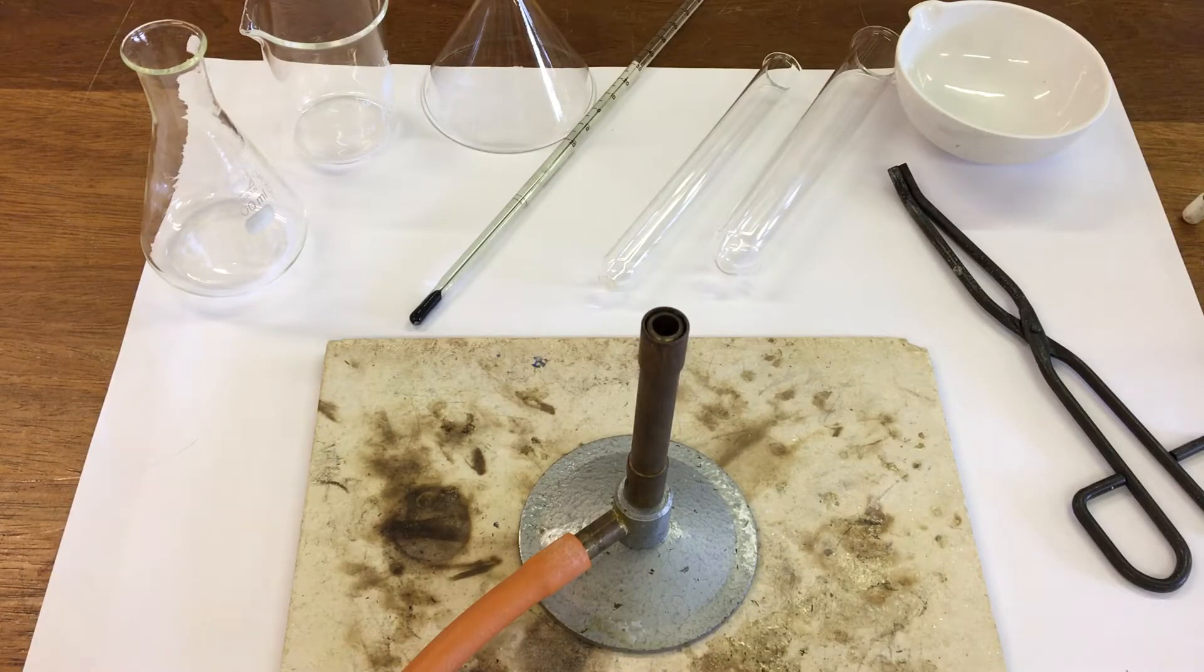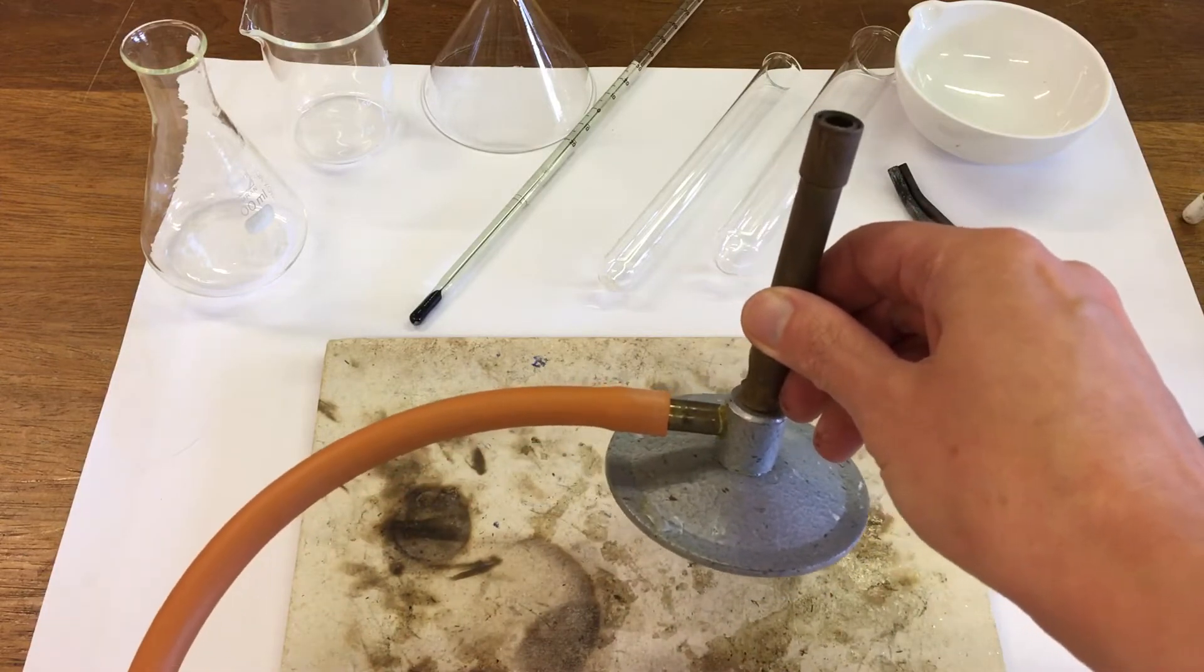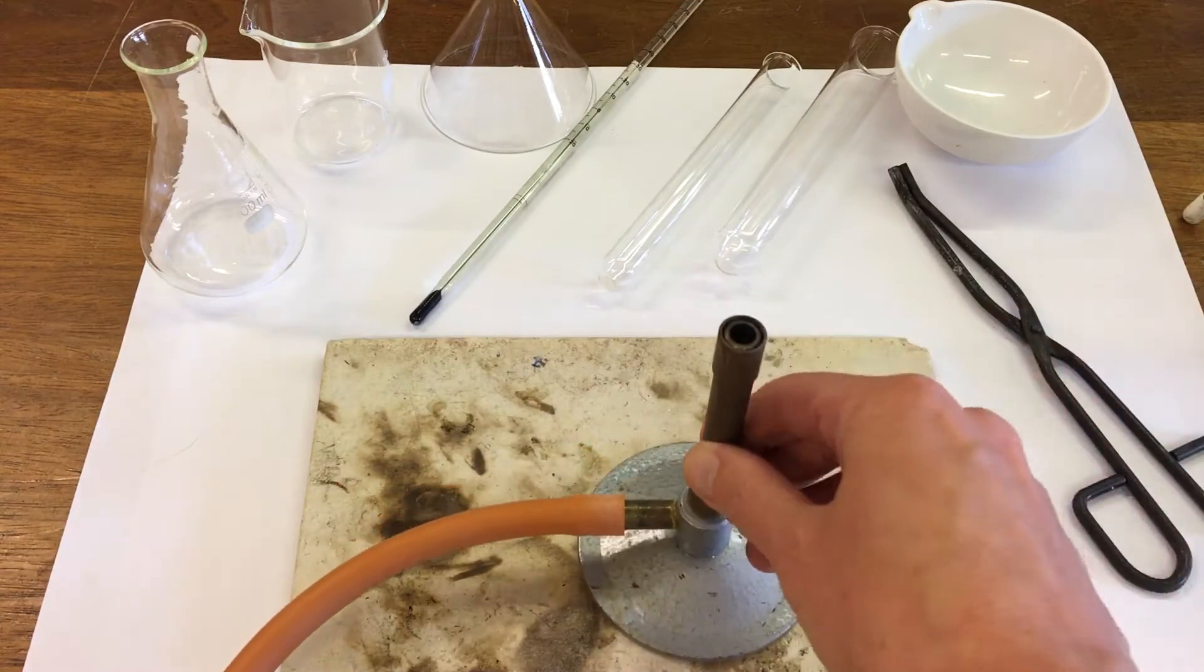Today we're going to look at some common laboratory apparatus. Our first item is the Bunsen burner. This is a Bunsen burner here with this pipe. It connects to the gas supply and we get a flame that comes out here for heating things.